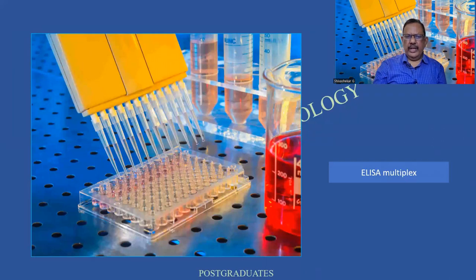So this I have already explained. I would like you people to kindly appreciate it. The only thing is that precision matters, and all of these are being adjusted by means of fine instruments called microtip pipettes.